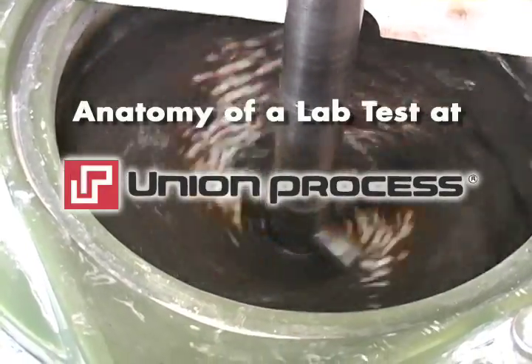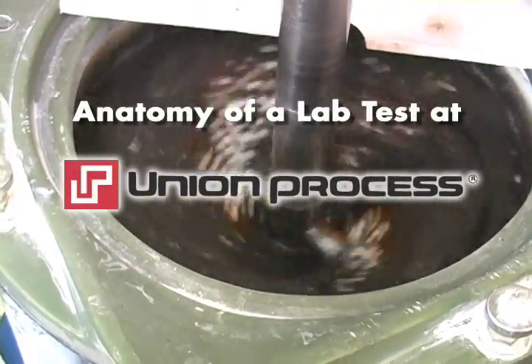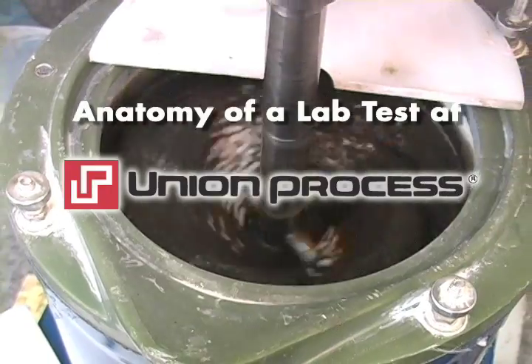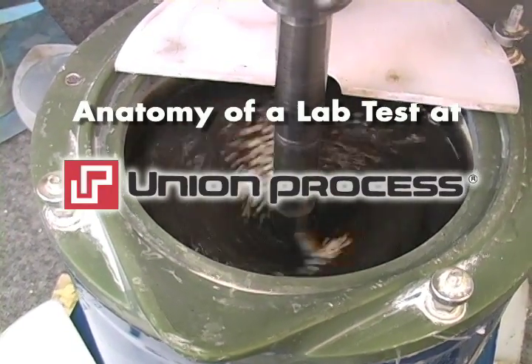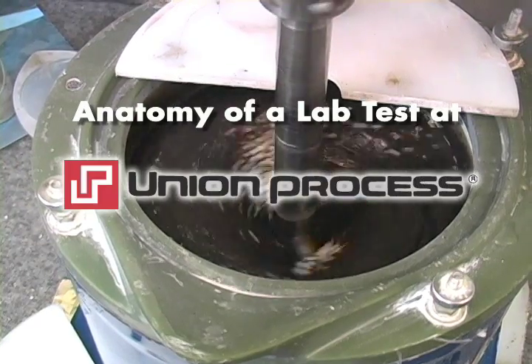Anatomy of a Lab Test at Union Process. The purpose of the lab test is to determine if one of Union Process's size reduction mills can produce the customer's desired final particle size.